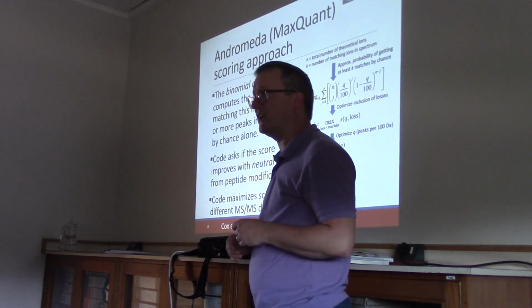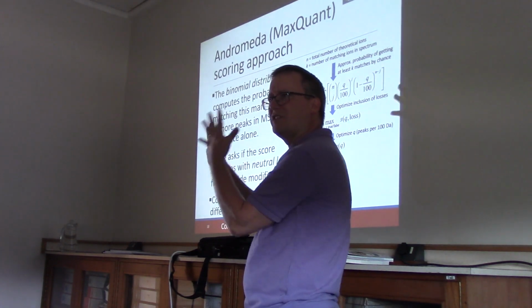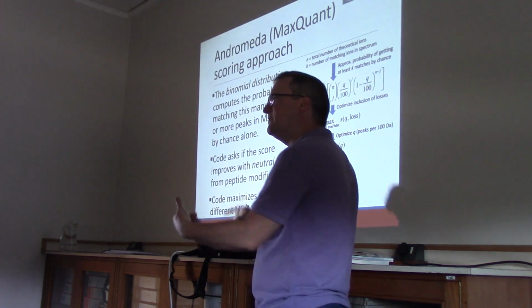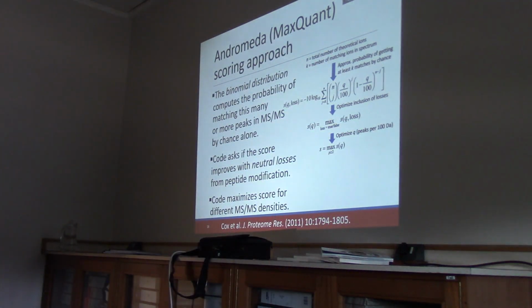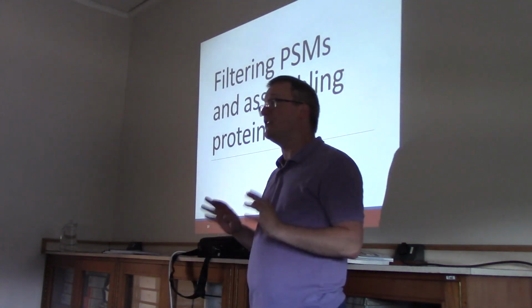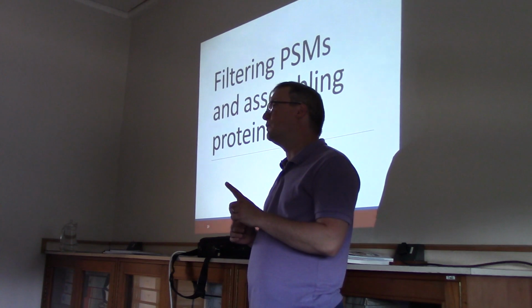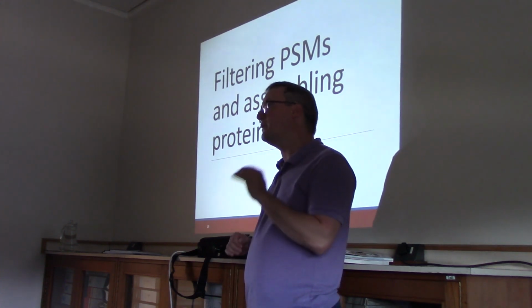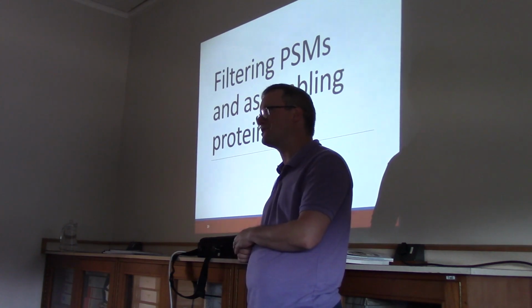That's how it does its thing. It's very different than Sequest, isn't it? Right? I mean, none of this cross-correlation business going on at all. This is just a match counter by comparison. So there are a bazillion other search engines. I'm not going to walk through them. In fact, we're going to take a break right here before we go on trying to figure out whether we can trust the result from our search engine.